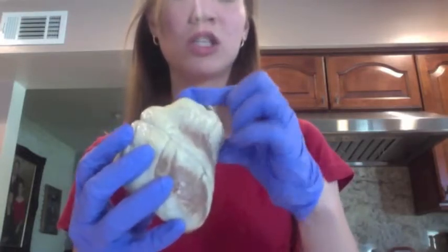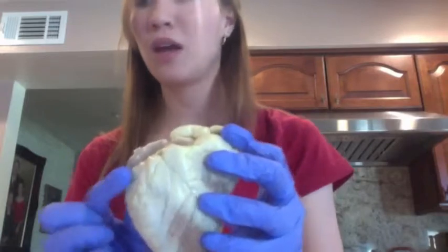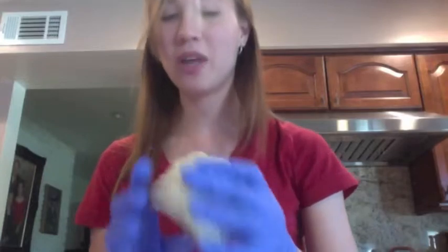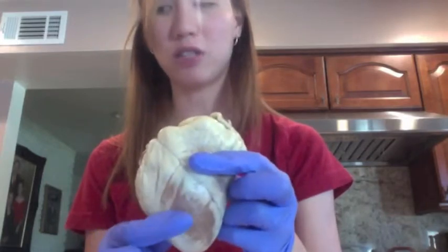We have our right and left auricles, which the right auricle is right about here, and the left auricle is about here. The right auricle collects deoxygenated blood from the bloodstream and moves it to the heart's right ventricle, while the left auricle collects oxygenated blood from the lungs and moves it into the heart's left ventricle. And lastly, we have our right ventricle down here, and our left ventricle down here.